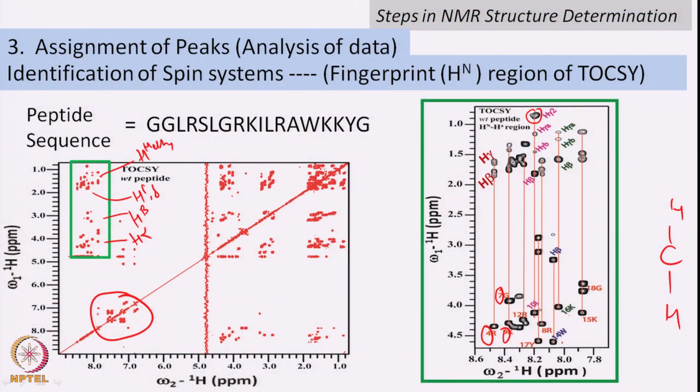This gives very important structural information. Now, as we have studied, NOESY gives you distance dependent correlation. So, that means this NH-NH correlation, if it is shown in the NOESY spectrum, this is the TOCSY spectrum, but I will come to the NOESY spectrum. It is shown in the NOESY spectrum, then that gives information about the distance. Here in the TOCSY spectrum, if we have an NH-NH correlation, that clearly says that the amino acid which has NH as a backbone as well as side chain can also give you here.